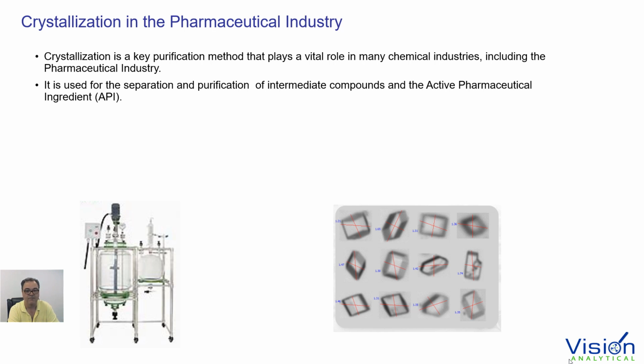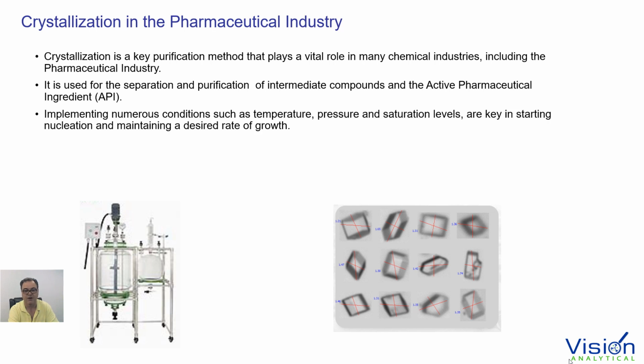There are many conditions that are used in creating these crystals. There are conditions having to do with temperature, pressure, saturation, with different solvents that are used. So I think the crystallization process is very unique to every application. But basically, the idea behind crystallization is similar, where we're looking for a good purification process to get an API.